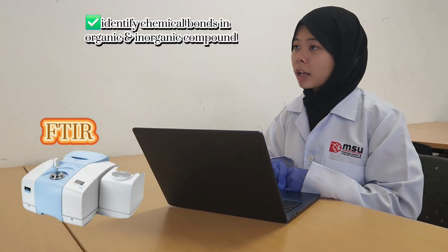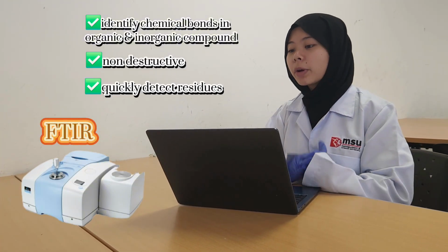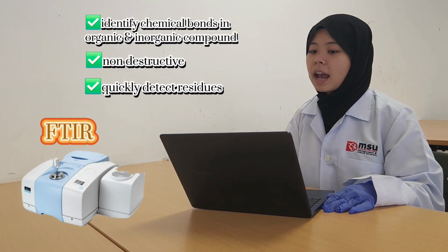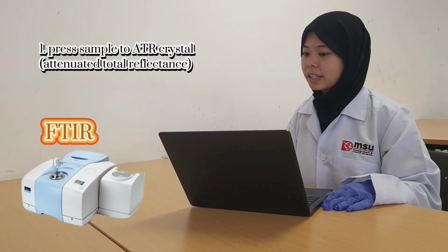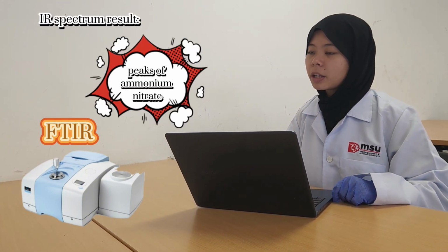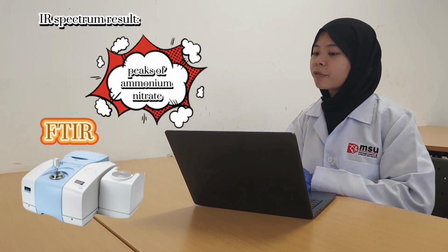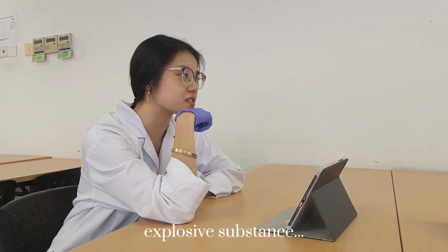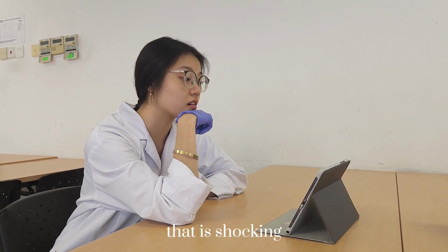FTIR identifies the chemical bonds in organic and inorganic compounds. It's non-destructive and can quickly detect residues like nitrates or hydrocarbons, which are common in explosives. I will press a small sample of the residue onto the ATR crystal and start the scan. The resulting IR spectrum shows peaks consistent with ammonium nitrate, suggesting the residue could be from an explosive substance. Explosive substance. That is shocking.